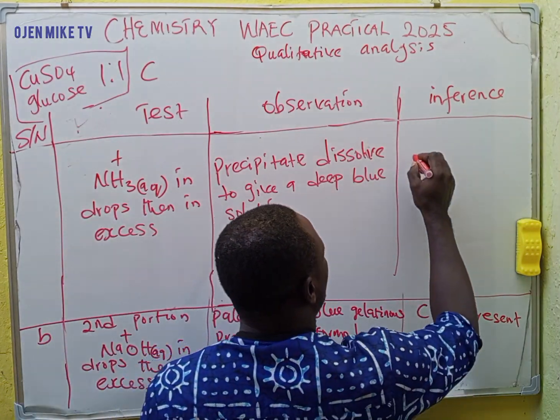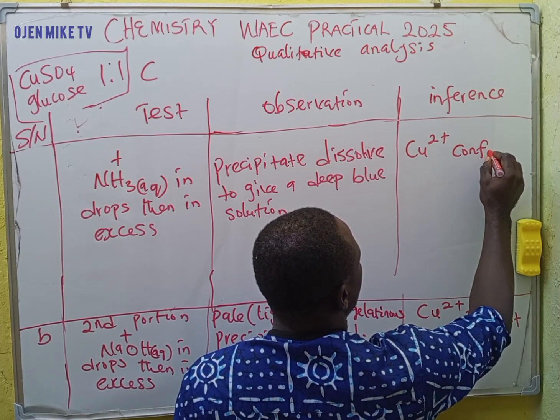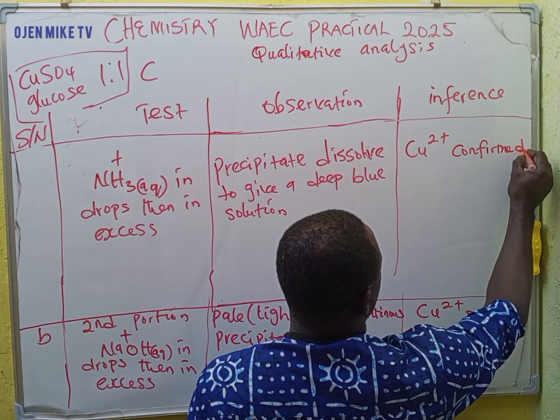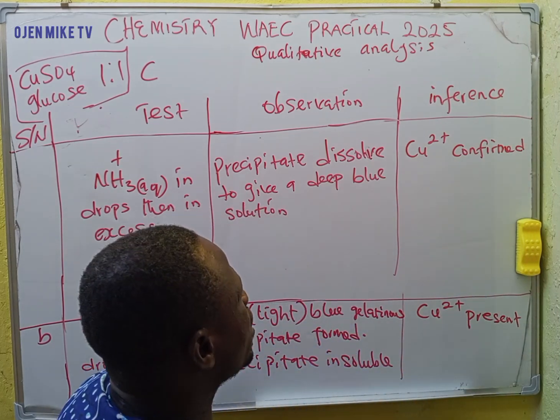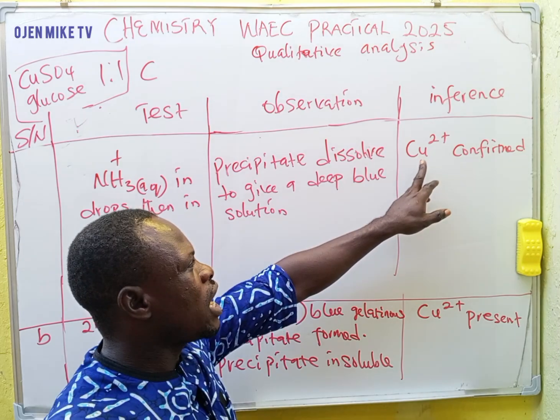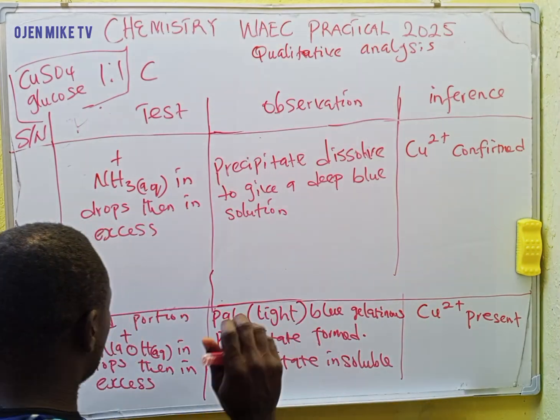That is to confirm what? Cu2+ confirmed. You get that? That is to say that you have confirmed copper 2 ion. Then we are done with that.